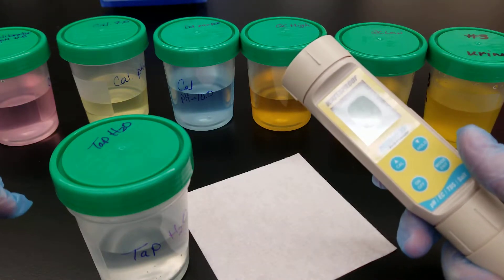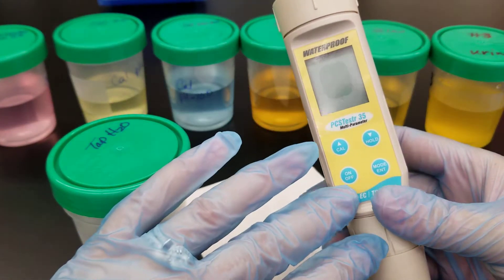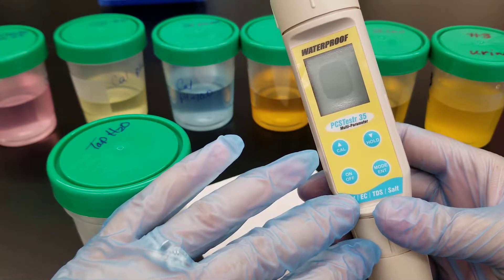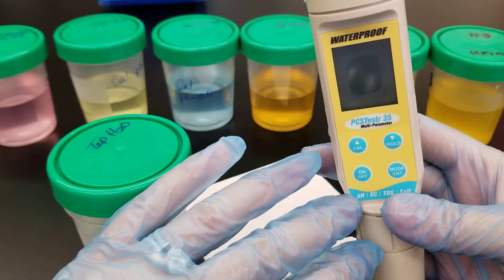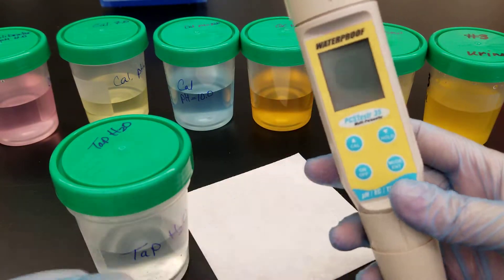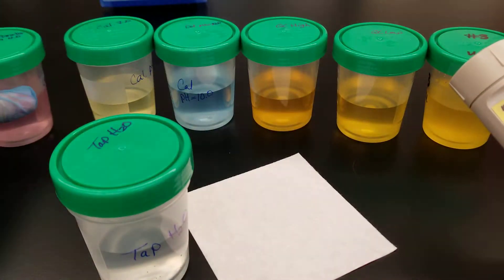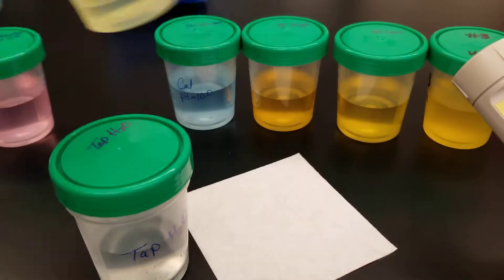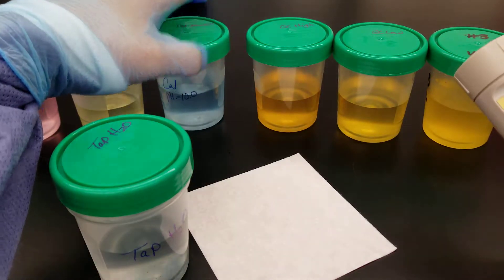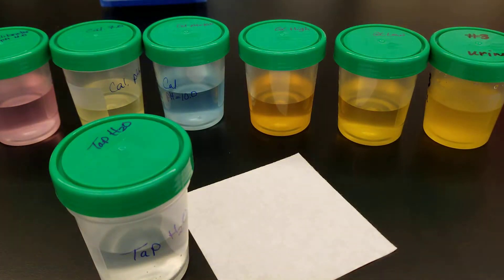The first thing we're going to do is talk about calibration. This pH meter allows you to do a couple of different types of calibrations. Calibration needs to be done at least one time weekly. We're using the U.S. setting, which is a three-point calibration: a four-calibrator (the pink one), a seven-calibrator (the yellow), and a ten-calibrator (the blue). Following that, we're using the high and low QC, and then there's a patient specimen.